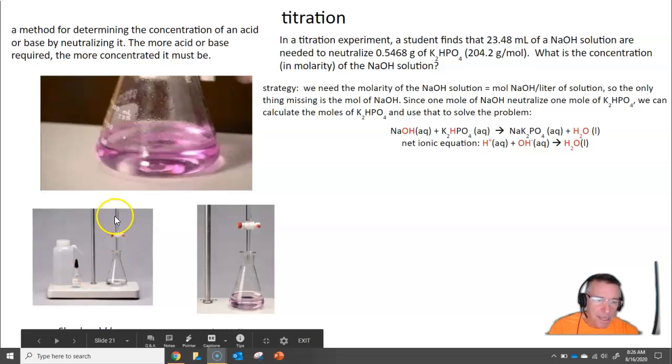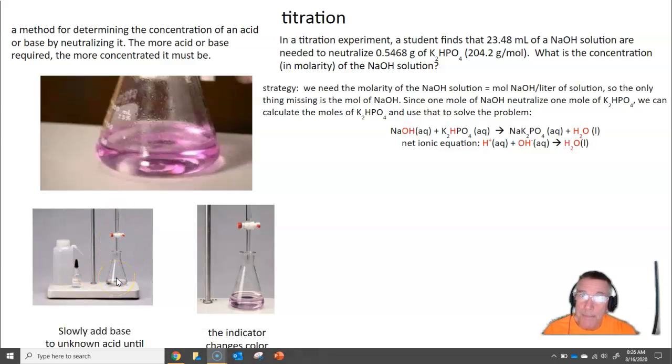So when you drip in the base, as long as you have a drop of indicator present, once that thing switches over from acidic to basic, the moment it does, it will start to turn pink. And if you can hit what they call a pale pink endpoint, you have done it very precisely. You've got your amounts and you can run your calculation.